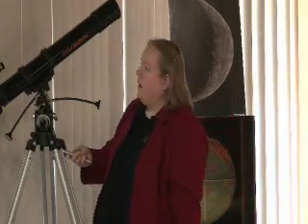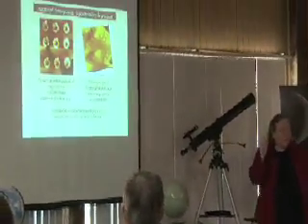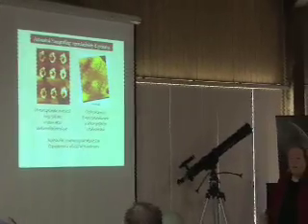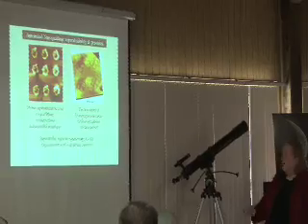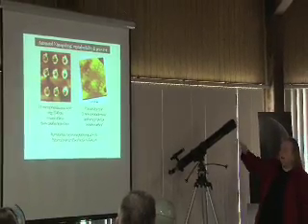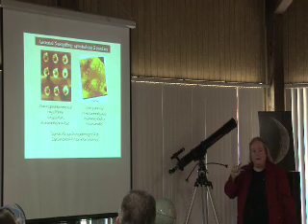Okay, these are some structures we made. So this is a 100 nanometer ring. The ring itself is only 100 nanometers from one side to the other. The actual width of the ring is like 20 nanometers. We're pretty small here. This is what my students can do. The undergraduates do this in my laboratory. They can make rings that are taller or shorter, depending on how tall or thick the molecules are.